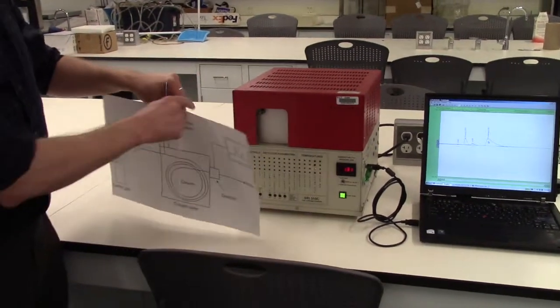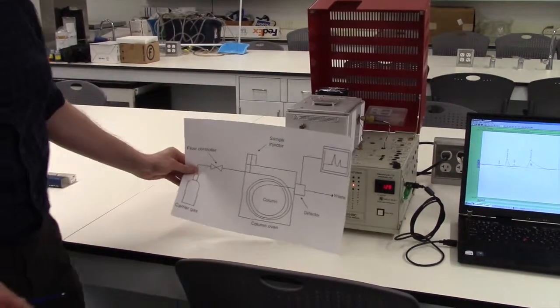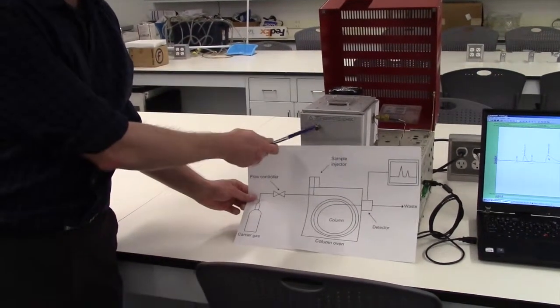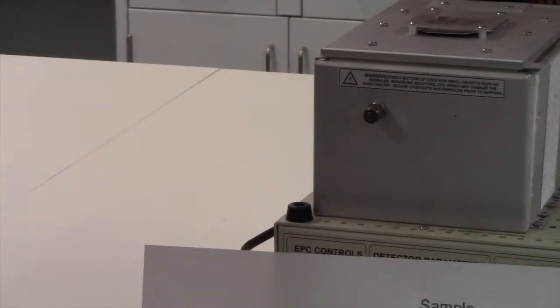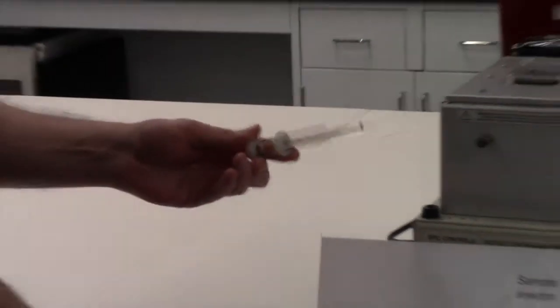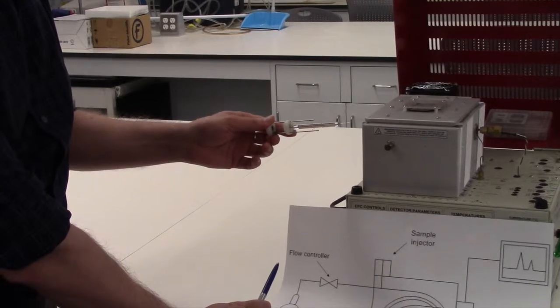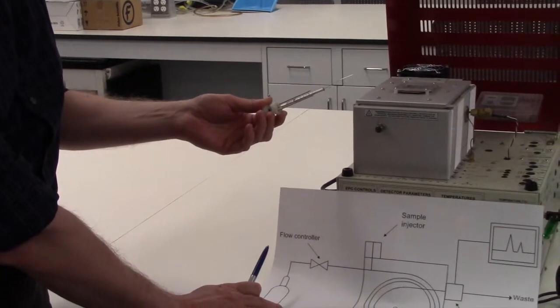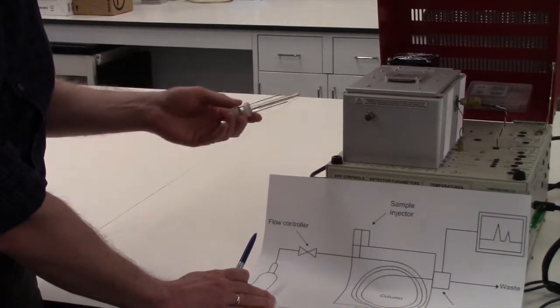So here we'll start with the injection port, which is for the injection of the sampled liquid material. We're using different types of syringes, and they have different volumes, from 1 or even half a microliter up to 100 probably.